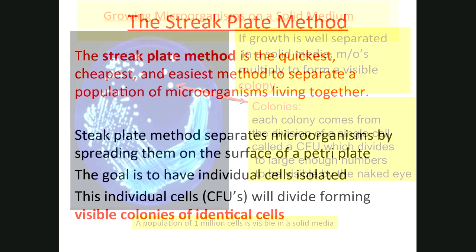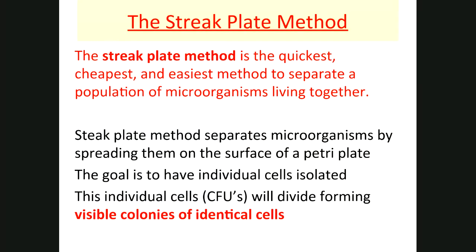All right. So there is a technique called the streak plate method for isolation, which is a quick and cheap means to obtain isolated colonies. Streaking for isolation means using this technique that will give us isolated colonies that we can use to create pure cultures.